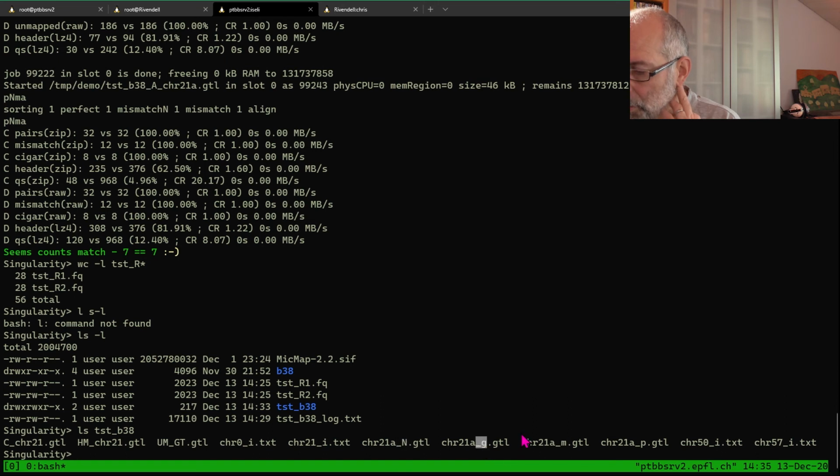And underscore G is for gapped reads. So those are those that have unique exact match on one chromosome. These are the unmapped, the half-mapped again, and the chimeric reads where one part of the read maps. They are not in a proper paired orientation as expected by the Illumina protocol in this case, for paired reads.